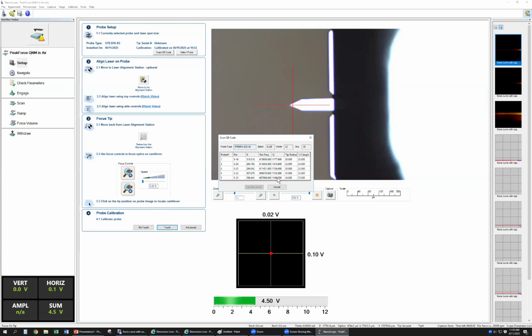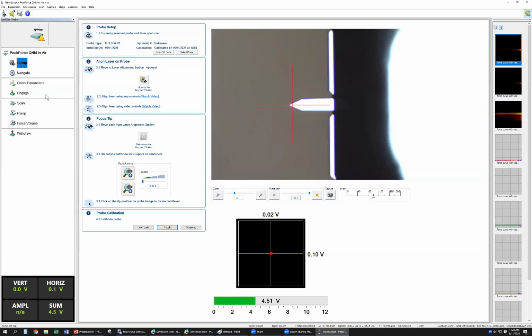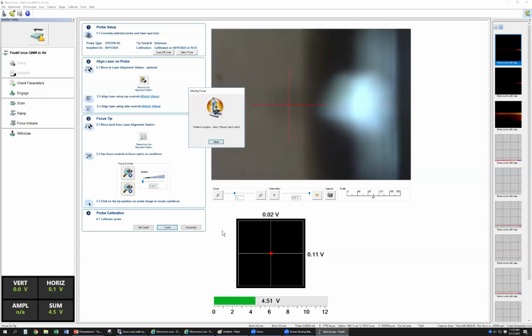You spend time, you need the money, and also sometimes the sapphire or the standard sample gets dirty, and you cannot get the data correctly. So they use very good samples to get the values. That's why sometimes you get a quite funny parameter, because of a quite funny value.